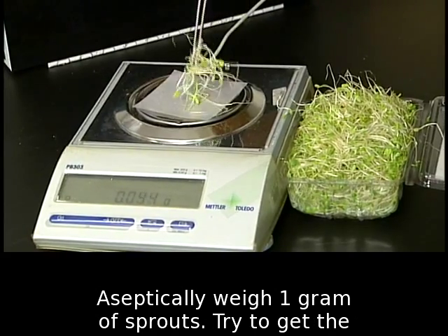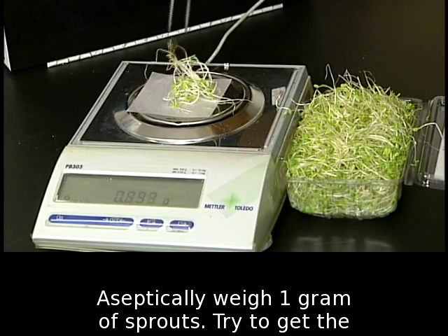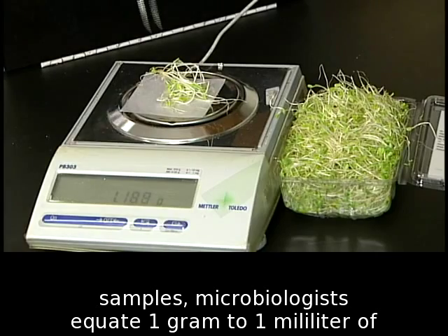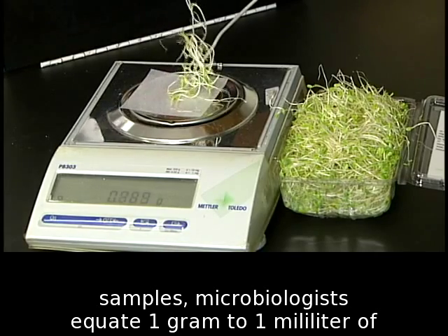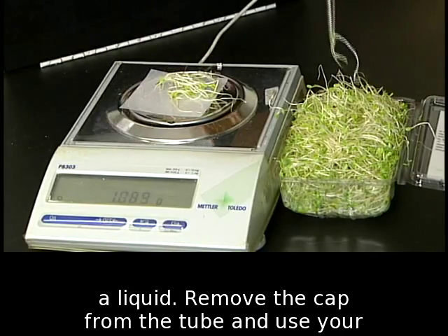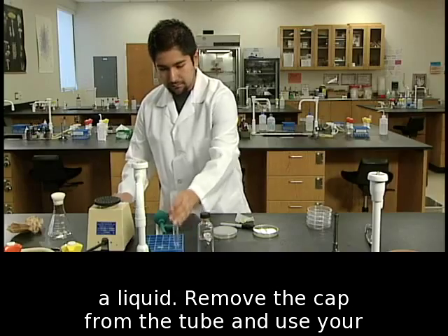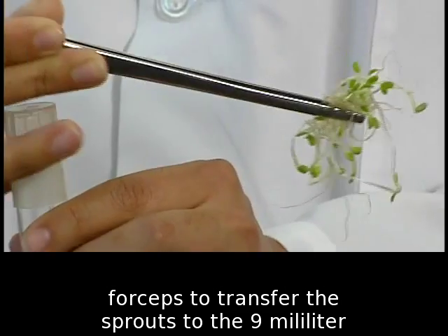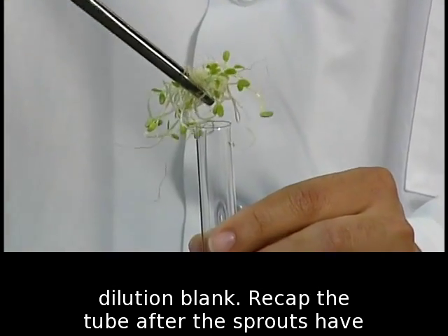Aseptically weigh 1 gram of sprouts. Try to get the measurement as close to 1 gram as possible. For solid samples, microbiologists equate 1 gram to 1 milliliter of a liquid. Remove the cap from the tube and use your forceps to transfer the sprouts to the 9 milliliter dilution blank.